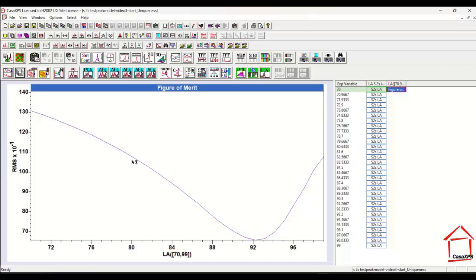We can see now that the scan is producing a minimum, and the minimum is somewhere about 90. So it's not surprising that I chose by eye the parameter to be 90. But I could improve on this by simply using this technique to work out the optimum line shape for the given fitting statistic, the given model, and the given data.